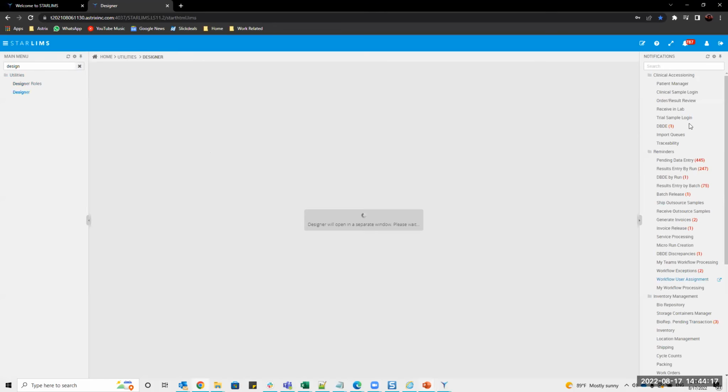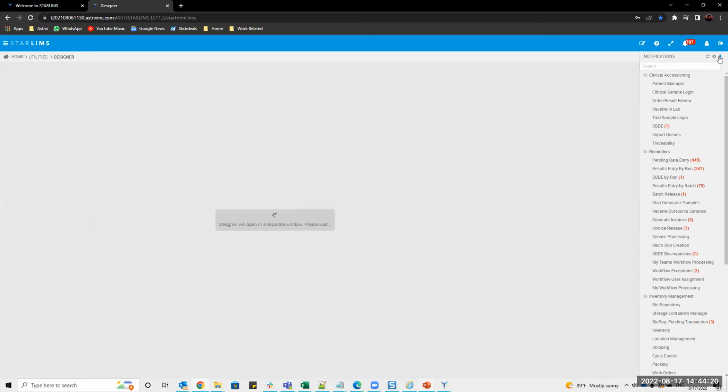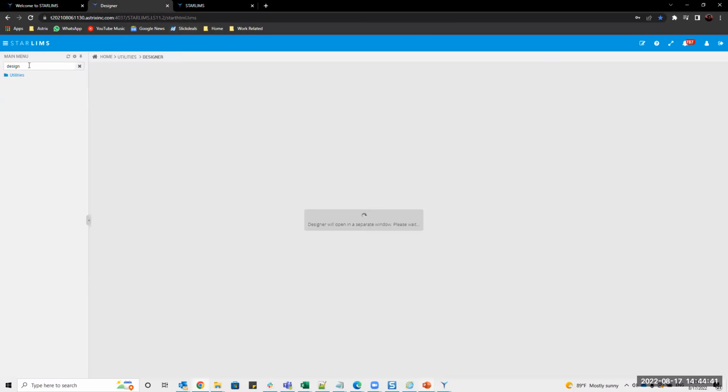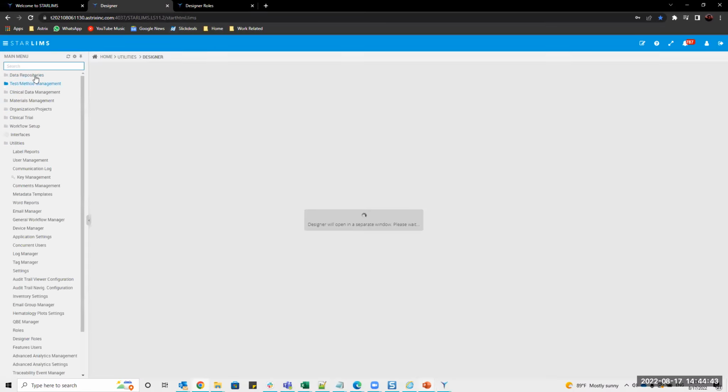Basically, this is the new dashboard. It has these little UX features where you can just remove things. The old one, you couldn't do that. You always kind of had that left-hand side and right-hand side. What else? You can pin it so that it stays. You can open up in tabs and have multiple tabs here. None of this was possible with the old one. So you can open up a bunch of these at once, and be working on several different things like we're used to when we browse websites and things.